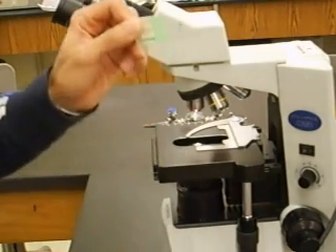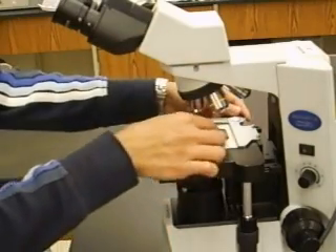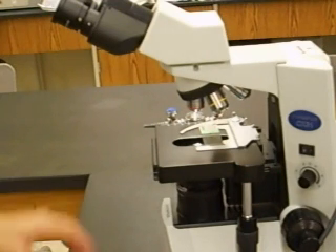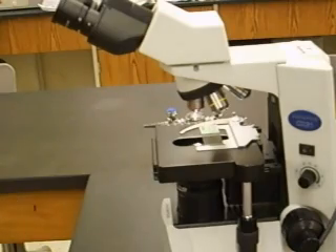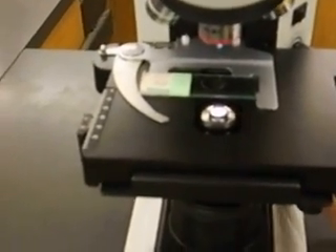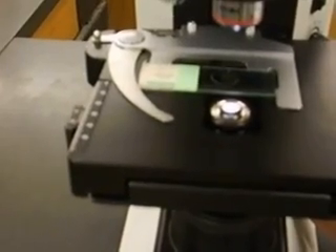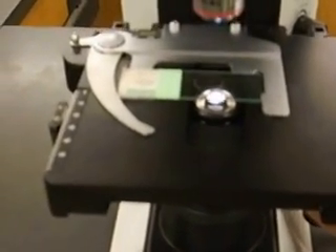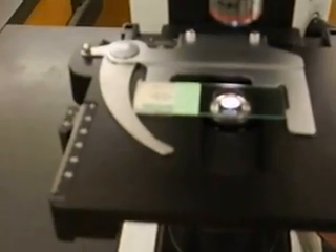When you're ready to look at your specimen, securely fasten it onto the microscope stage by placing it in the middle of the silver clips. Once it's on, make sure your specimen — the circular cover slip — is positioned directly over the light source. If it's not over the light, turn the stage movement knobs to move the specimen right over the light source.